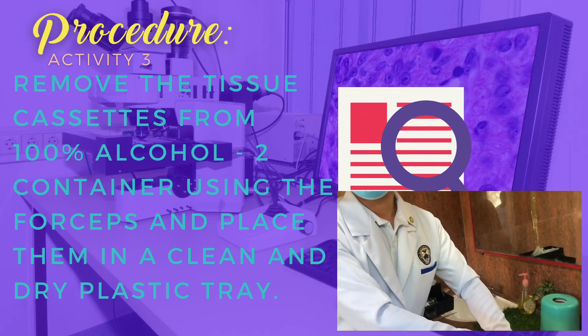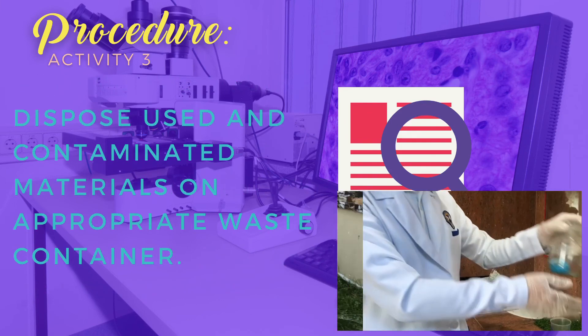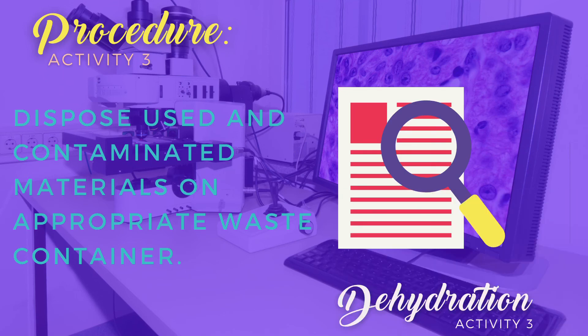Remove the tissue cassette from the 100% alcohol container using the forceps and place them in a clean dry plastic tray — in this case, we will be using a glass. Then don't forget to dispose of your used materials properly.